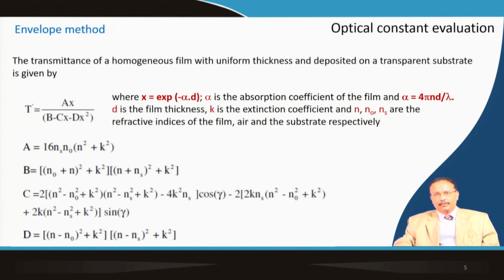This will be illustrated in this lecture, and if required I can give you the transmittance and reflectance as a function of lambda data, which we get from a UV visible spectrophotometer, for you to independently do all this series of calculations, and the results that I will be showing in this lecture you can exactly repeat to have a feel of how it works.